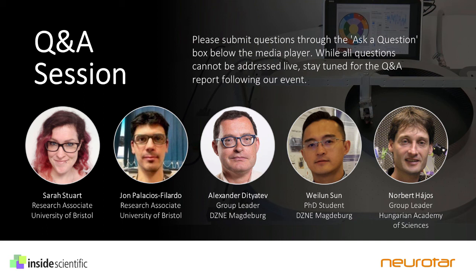From our experience and the few single cell recordings that we have, I say few because altogether they are not more than 20 recordings, we found a wealth of neurons that show a location preference to a spike. However, we are planning to do acute recordings with silicon probes where we expect to record more than 100 or 200 units per experiment, and then we will have definitive results.